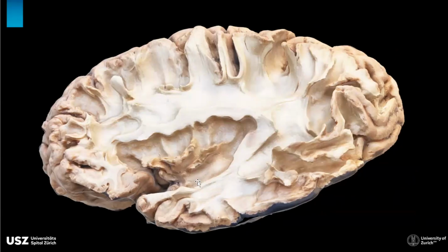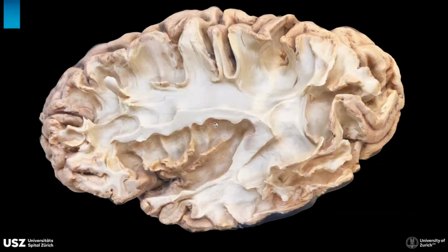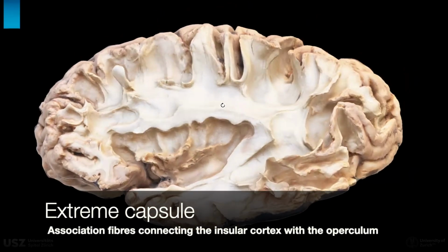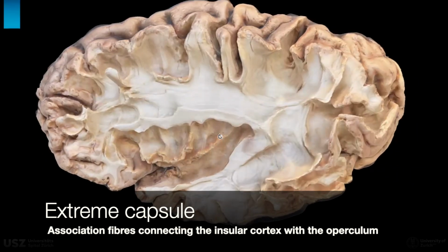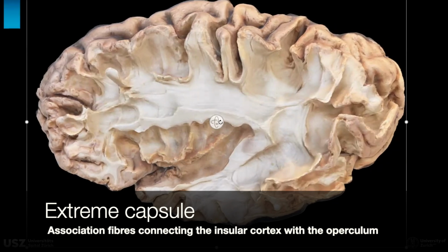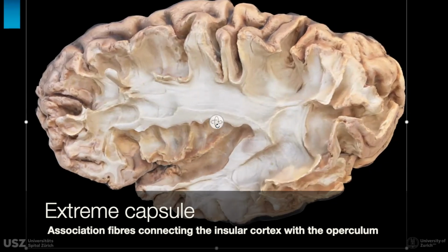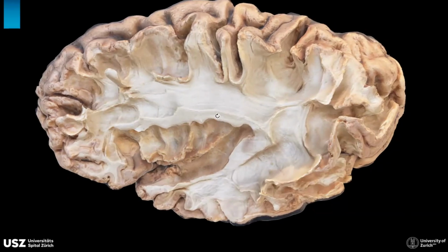After removal of the cortex of the insula, we will recognize the so-called capsula extrema, or extreme capsule. These are association fibers connecting the insular cortex with the operculum. So they have a very marked arching course around the peri-insular sulcus.